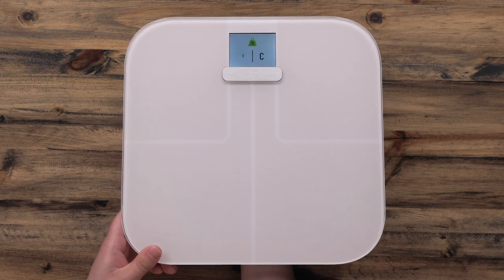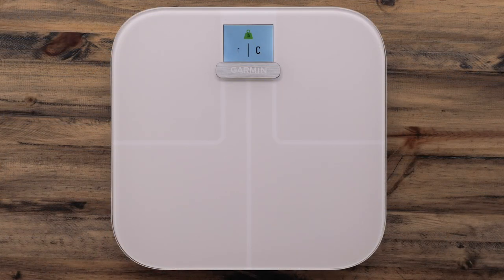You will see the temperature unit screen. Press and hold the button until the unit changes to your preferred unit.